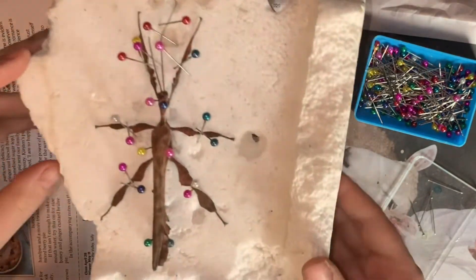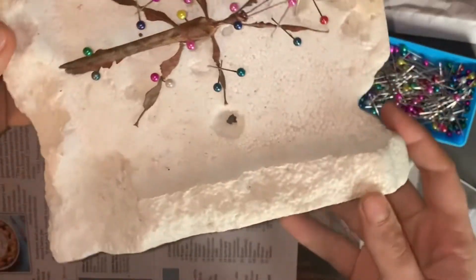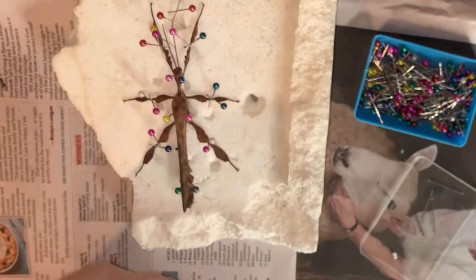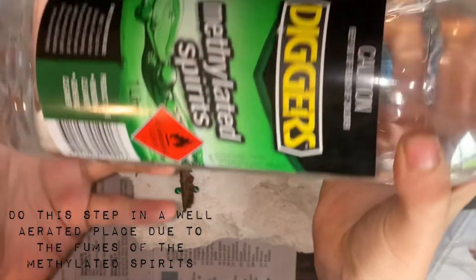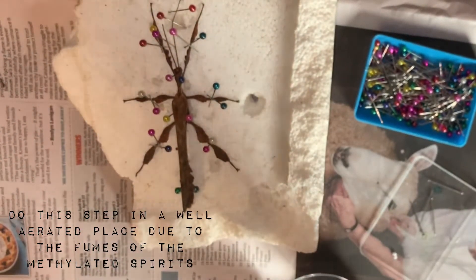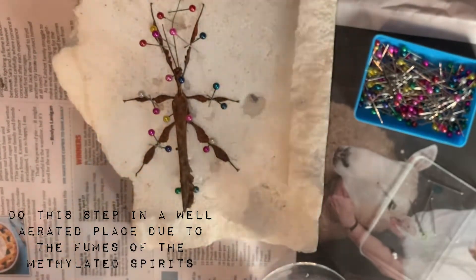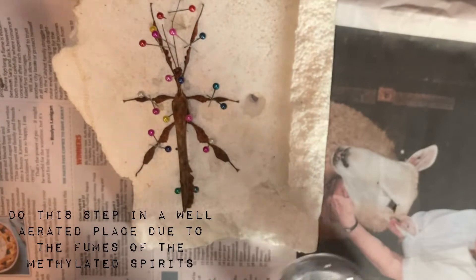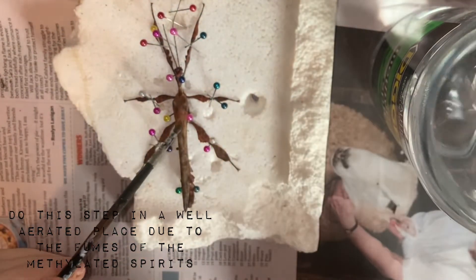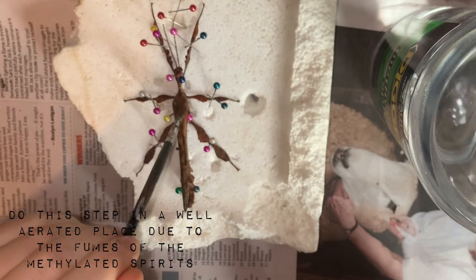You are now finished the pinning process and can move on to the preserving process. Using the methylated spirits and the small paintbrush, gently paint a layer of methylated spirits over the entire stick insect. This step is to further ensure that the invertebrate does not begin to decay and to maintain its natural coloration. Once finished, find a dry place to put the specimen so that it can dry out.